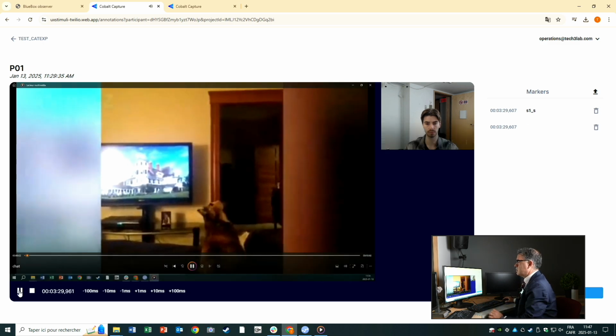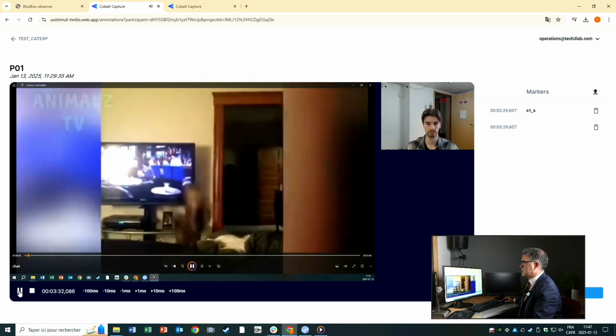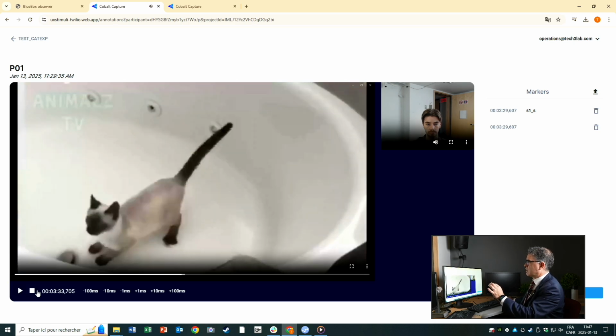And just for the sake of this, I'm going to add a marker for each of the segments, with a start and an end. So I will say this is segment 1, and this is the start. I'm going to add the marker, and I will continue on here and try to be as precise as possible when we move to the second video.